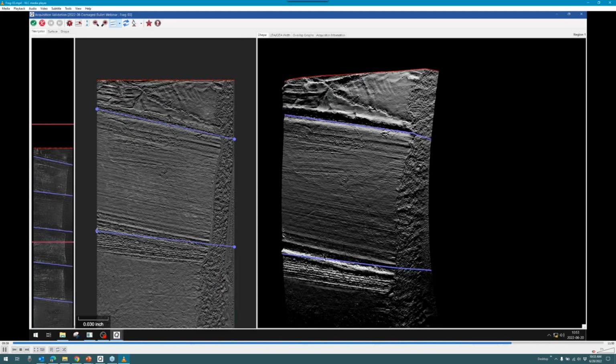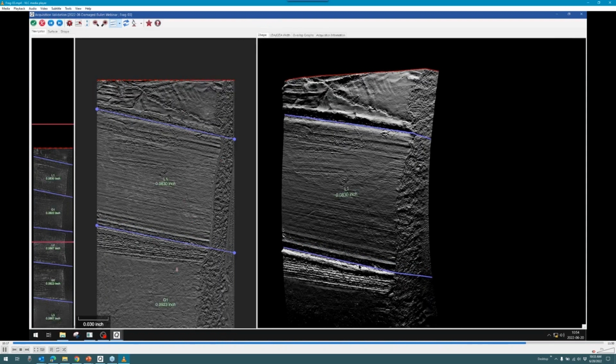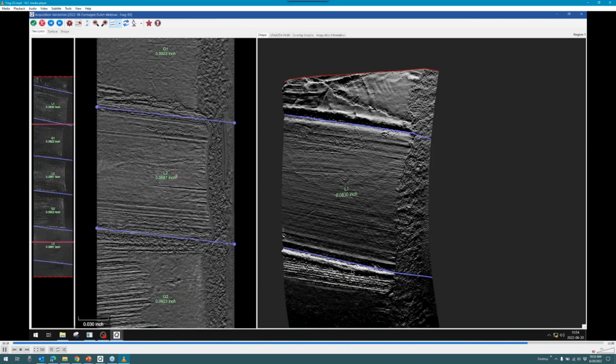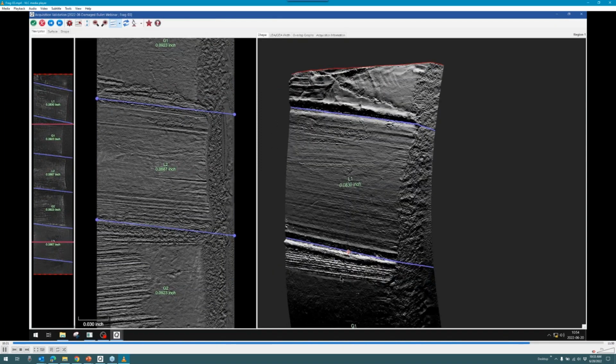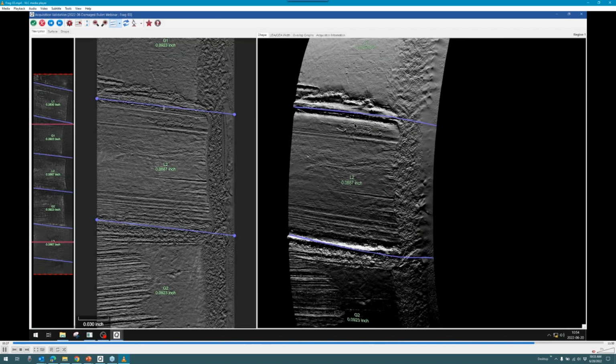But because of the way the light is angled, the raising slope here, where it goes from the low land engraved area to the high groove engraved area, is actually reflecting the light. So here at the top shoulder, it goes underneath the shadow. Here it's placed, for the bottom shoulder, just above the reflection. Move on to the next one, follow the same steps. This line is going to get corrected to go just underneath that shadow. This one, the angle is going to get corrected, and it's going to be placed just above that white line.